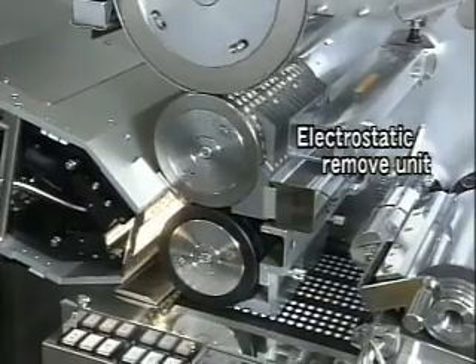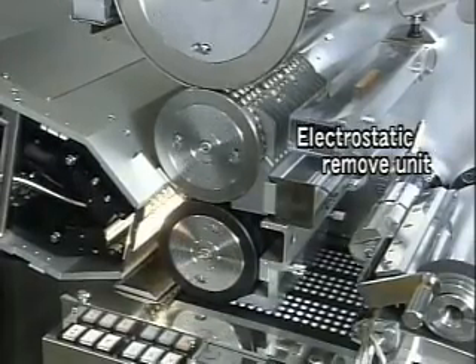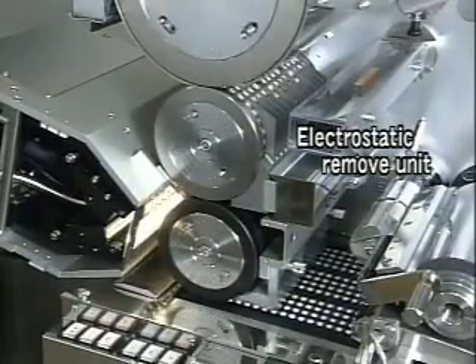After inspection, the tablets are transported horizontally to the slat in the most stable position according to their shape.